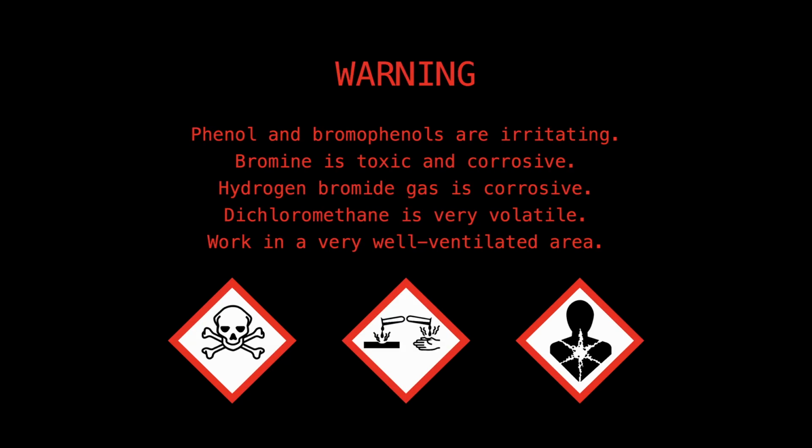Warning: phenol and bromophenols are irritating. Bromine is toxic and corrosive. Hydrogen bromide gas is corrosive. Dichloromethane is very volatile. Work in a very well ventilated area.